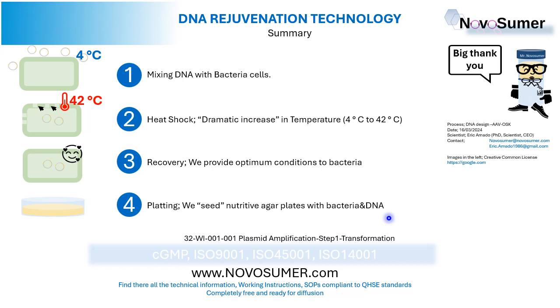This has key points to understand the technology, but all the technology is in the website that will be available in the following months. You will find this information in the form of a protocol, SOP, or working instruction, that is called 32, blah blah blah, plasmid amplification, step 1, transformation. You will find this protocol, I'm sorry for the blah blah blah, in the website.